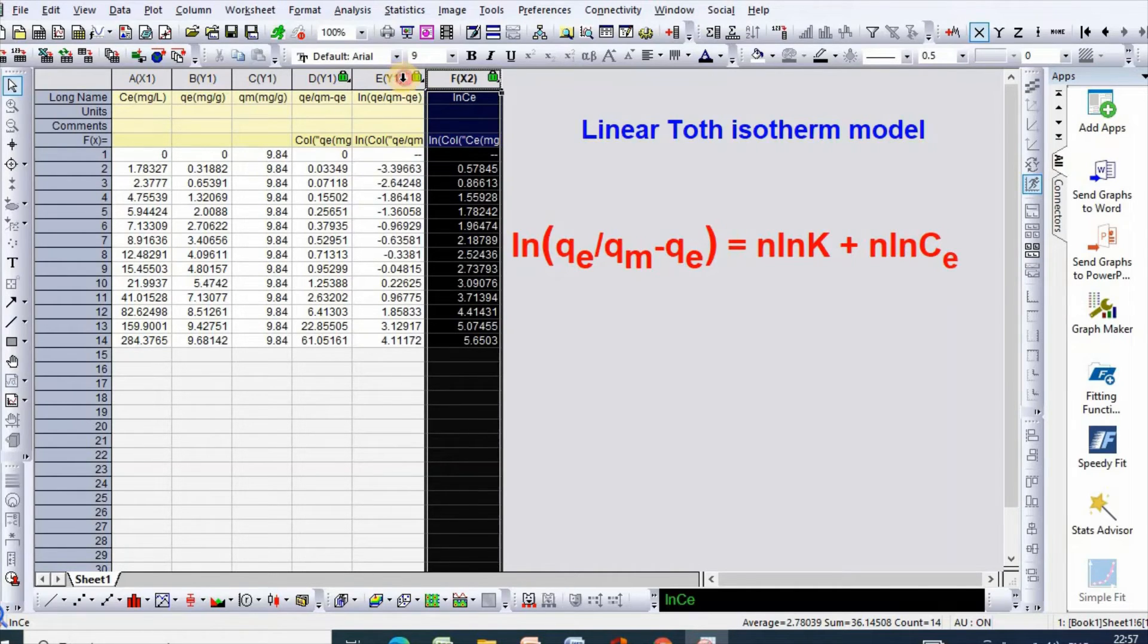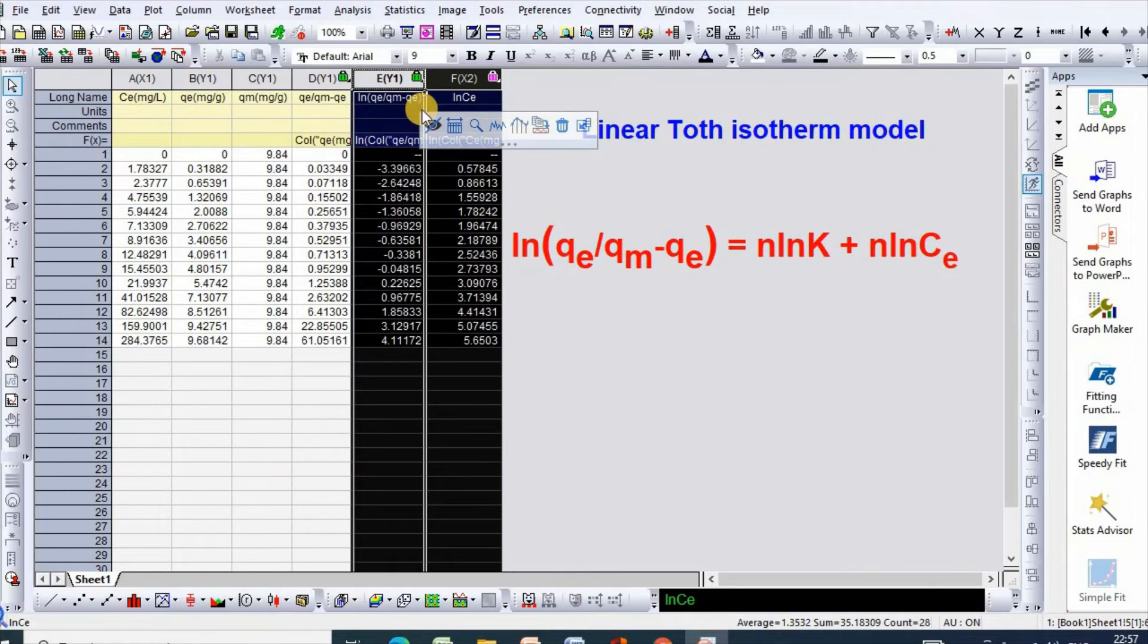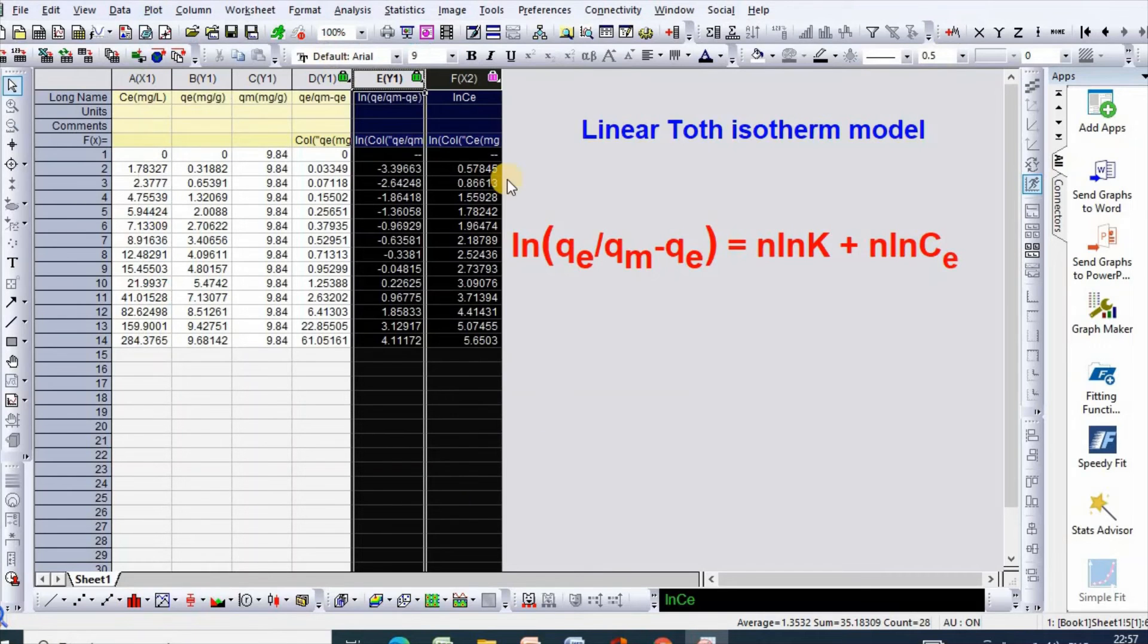Then, select these two columns and go to plot, then scatter.